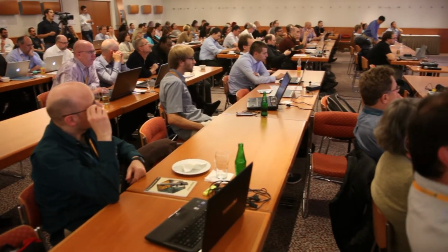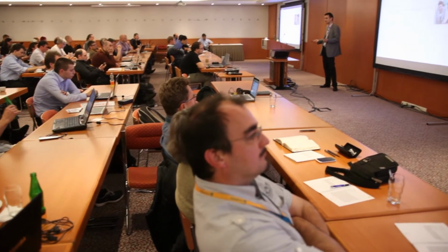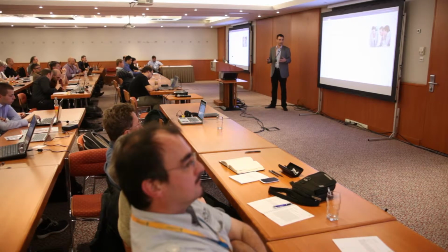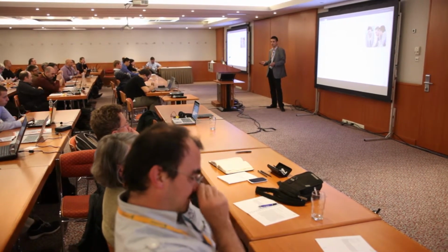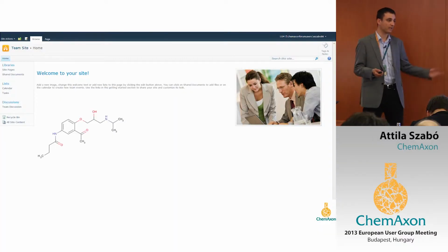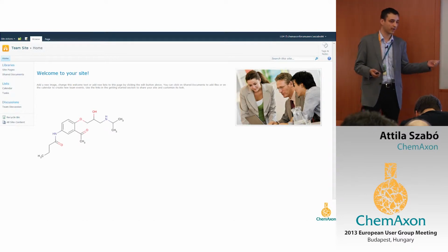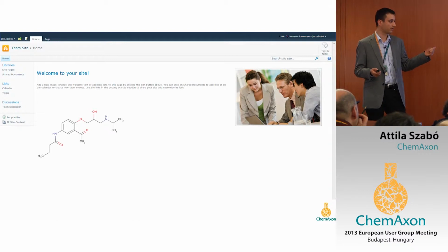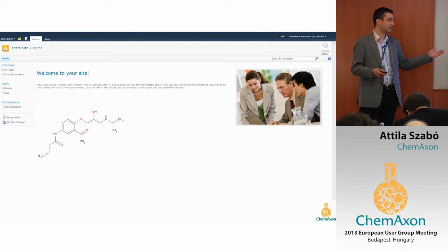But if you are working in life science industries, and you would like to share information about chemical structures, then it's essential to visualize these structures. And that's where ChemAxon comes into picture, because with JChem for SharePoint, you are able to draw and edit chemical structures and add them to any SharePoint sites.